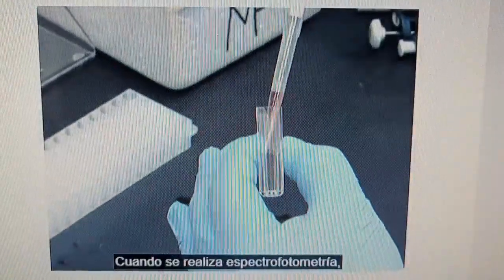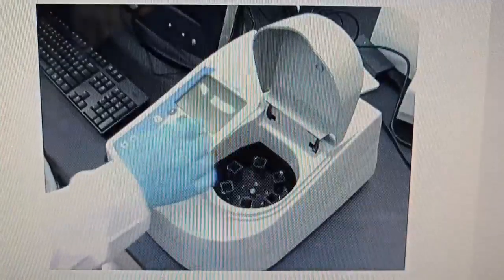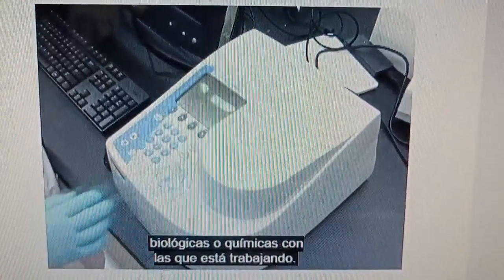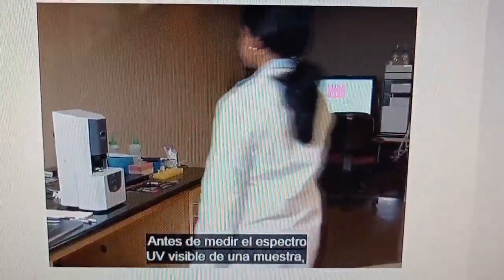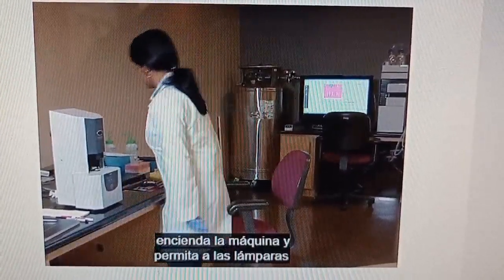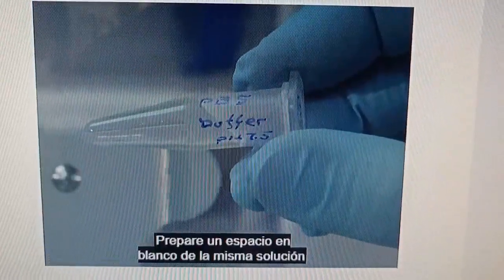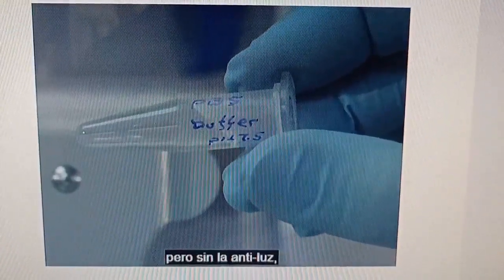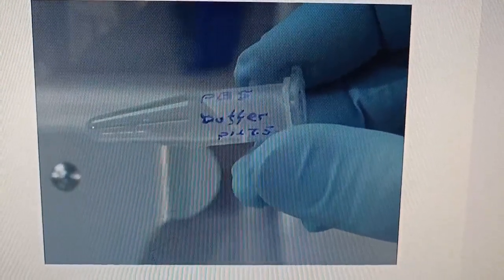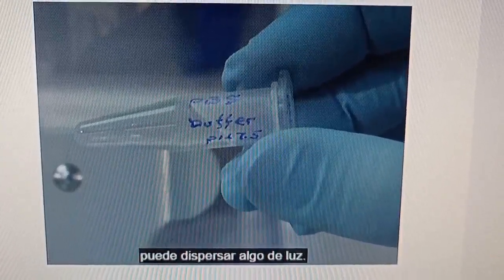When performing spectrophotometry, be sure to take appropriate precautions, such as wearing gloves, depending on the type of biological or chemical solutions you're working with. Before measuring the UV visible spectrum of a sample, turn on the machine and allow the lamps and electronics to warm up. Prepare a blank of the same solution, but without the analyte, having the same pH and similar ionic strength, a necessary step as the cell and solvent can scatter some light.